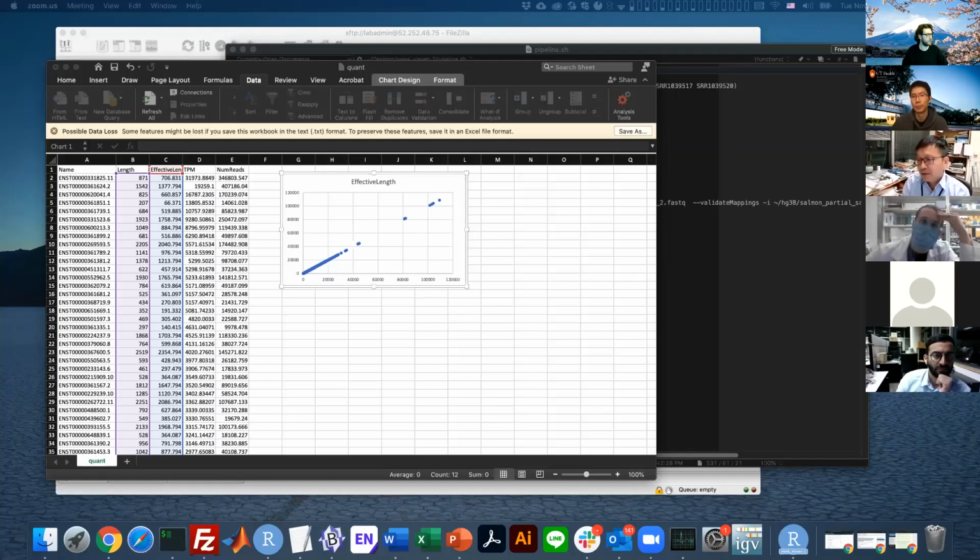I'm giving you the on average value, but in reality they have to get the estimate from the FASTQ file. So it caused some issues, and I don't particularly like it. That's the other thing you may not like about TPM, RPKM whatsoever. So that could be the other reason. Because if you could just simply give me the RPKM or TPM without telling me the fragment length, I really cannot get back the raw recount anymore, because that becomes a guessing game.